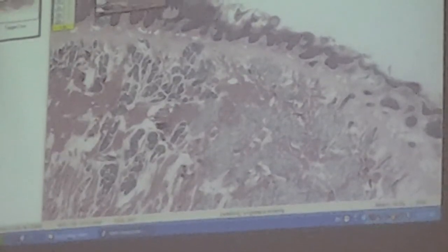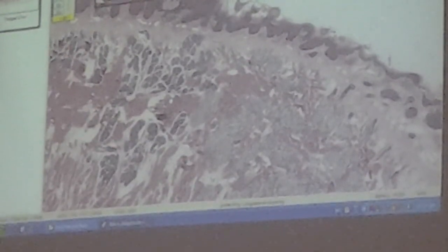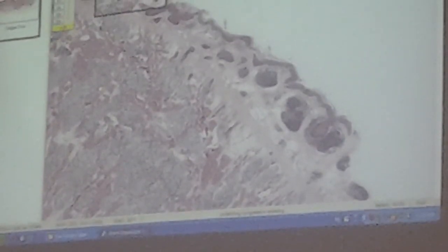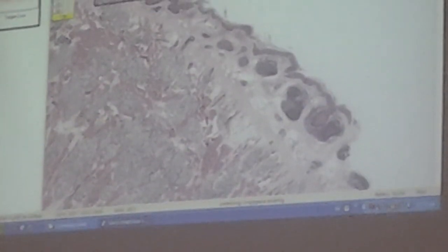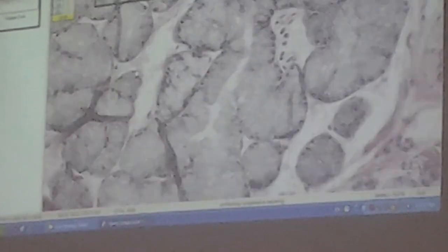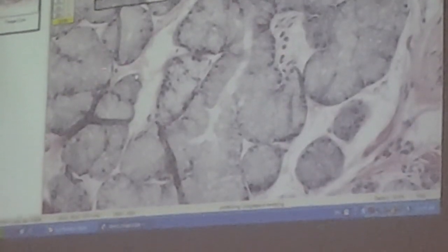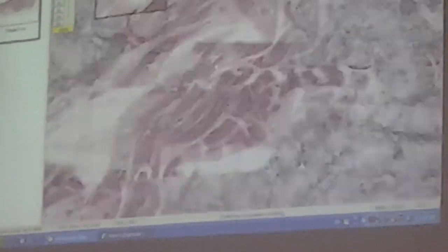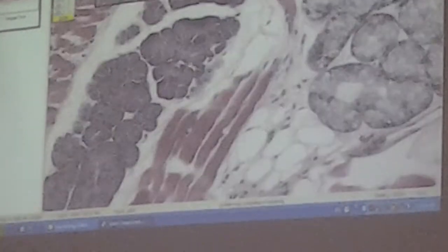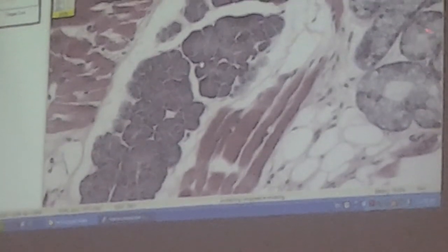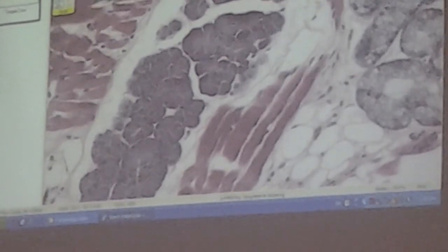What do I see in the posterior part of the tongue? I see two important things: I see mucous glands. The basophilic glands are in the middle, and this is non-basophilic.